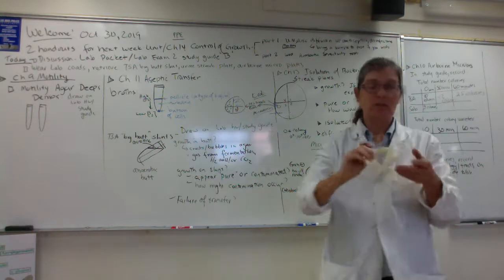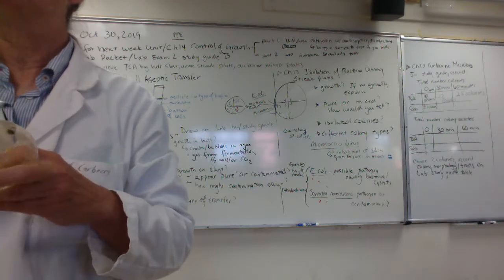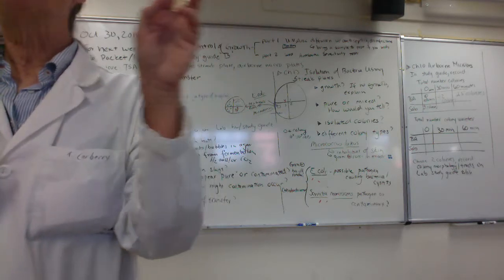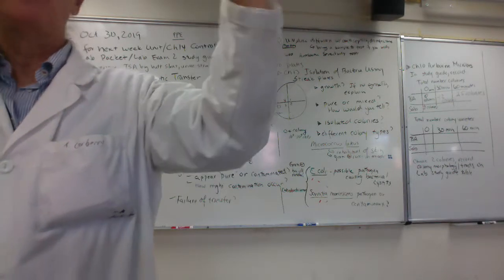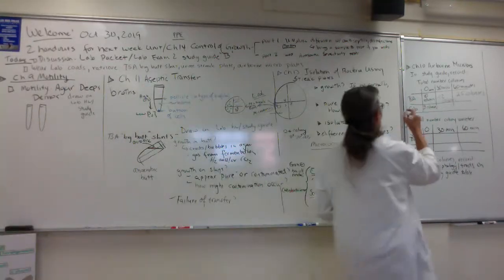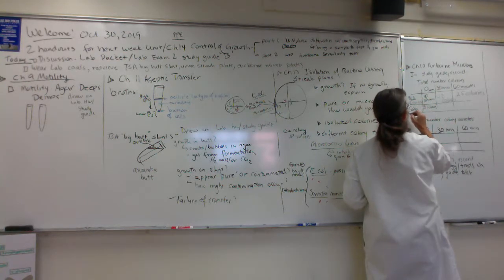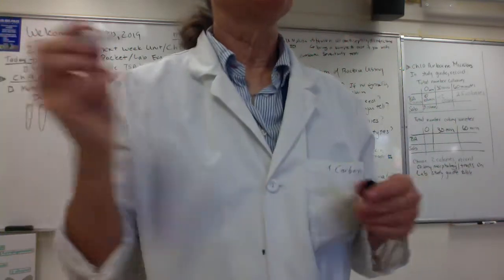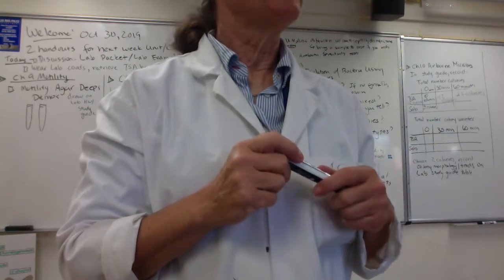Okay? And then, folks, if I took my SAB plates, do you think I should have more colonies on SAB or fewer colonies on SAB? Let's think of it. TSA, what kind of functional media is it? It's all-purpose. It's going to grow both bacteria and fungi. In contrast, what about the SAB? Only fungi. It selects for fungi. My guess would be, but remember the microbes don't read the books, that you might have fewer colonies on your SAB plate. Might not always be true, but possibly.